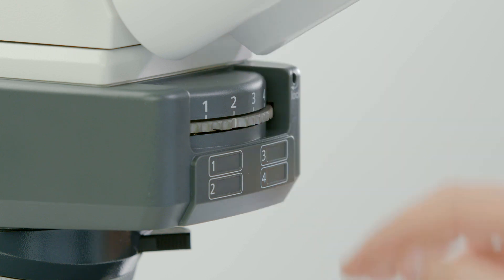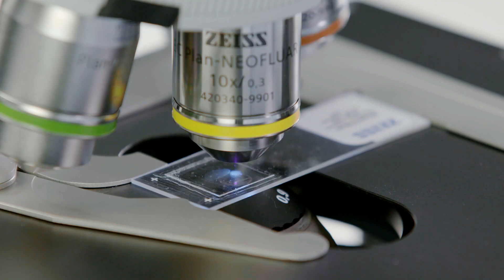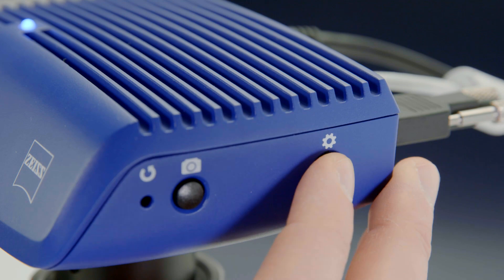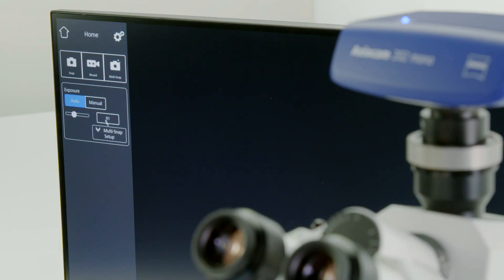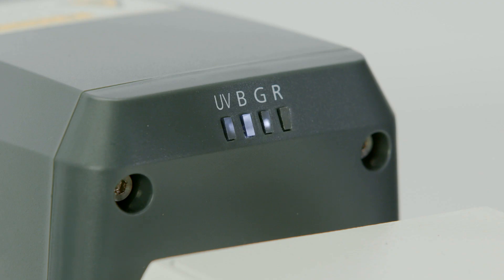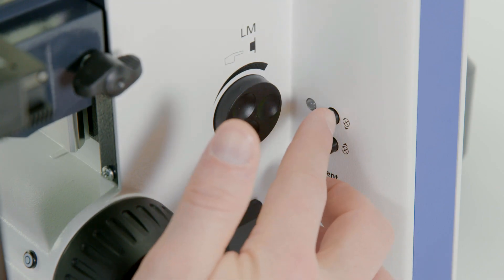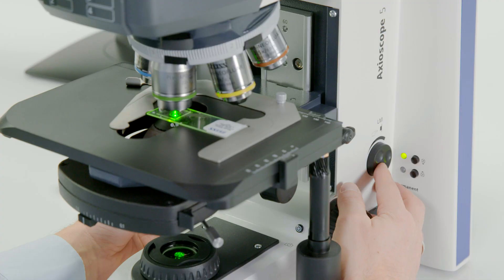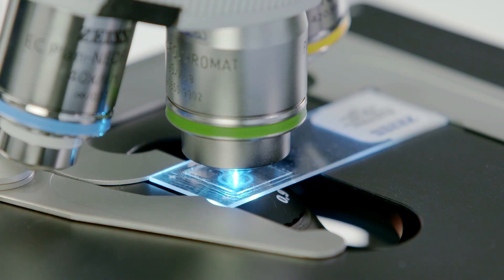Switch to the reflector position containing an appropriate multi-bandpass fluorescence filter, then define the relevant fluorescent LEDs for excitation suitable for your sample via the on-screen display. For the sample shown, it is UV, blue, and green. Now you're ready to switch to the fluorescence mode on your Axioscope 5 microscope. Toggle to the UV LED — since DAPI provides a strong fluorescent signal.